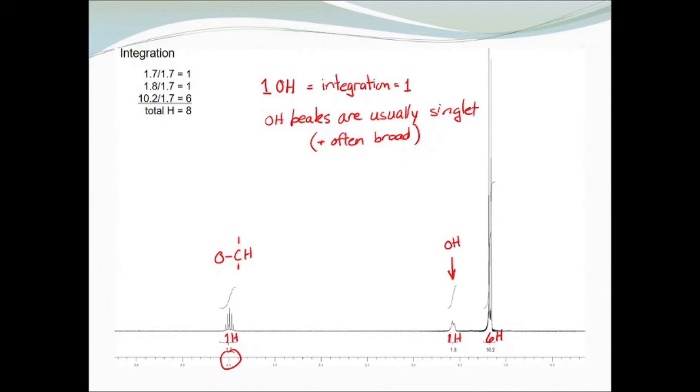about 1.2 ppm. So this is the typical alkyl region, 6 hydrogens. We're not likely to have a CH6 since carbon cannot form 6 bonds. So this is almost certainly going to be 2 methyl groups, 2 CH3 groups.